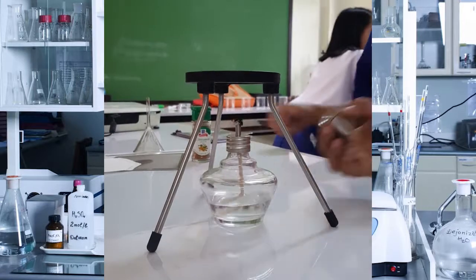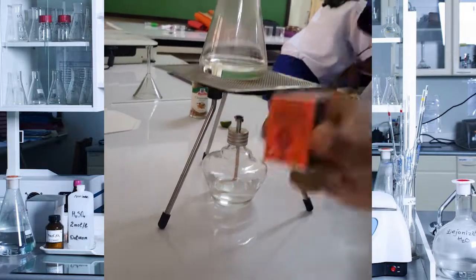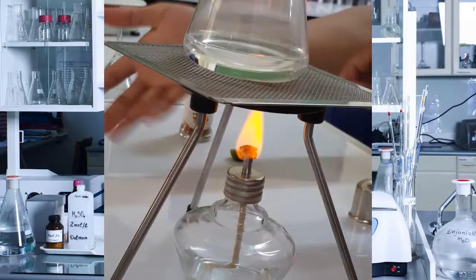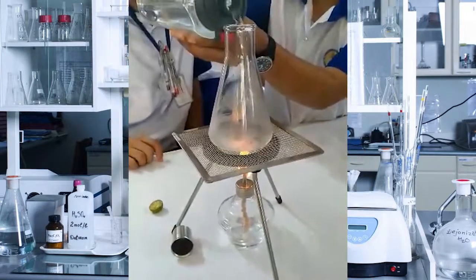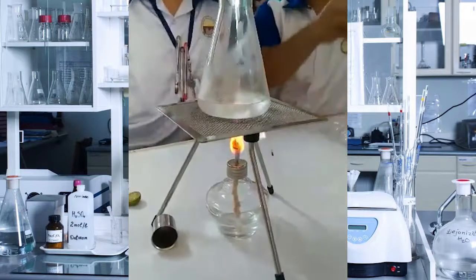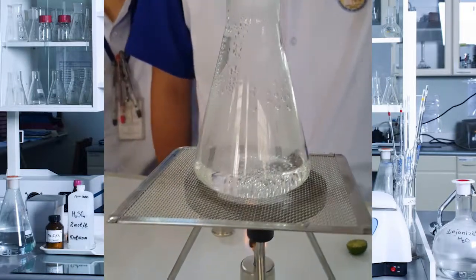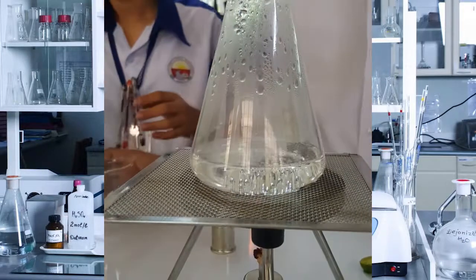So, our substances are oil and water. We mix the oil and water in an Erlenmeyer flask, then put it on the tripod with the alcohol lamp heating up. We leave it for a while to boil. As you can see here, the water is boiling while the clumped oil at the top of the mixture is not. This is due to different boiling points.